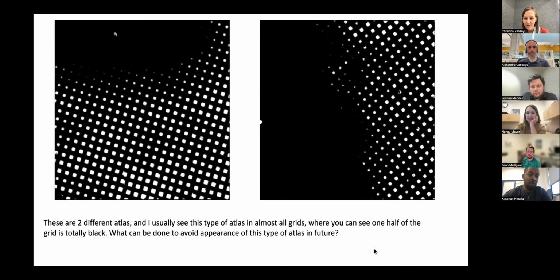And sometimes you may run into preferred orientation issues when you are only collecting on large squares versus medium size. So it's always good to have different kinds of squares where you can screen and figure out where your particle is the happiest. Once you determine that, you can move forward with your data collection targeting those similar squares. So it's a good thing that you have this, and not the whole thing is the same kind of squares.